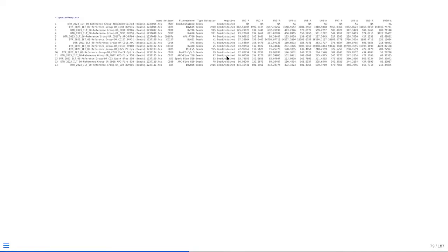But if we go back to what we had for that retrieved value, you can see it wasn't able to correctly retrieve the actual signature from the bead unstained just because no detector value was provided, so we had a little breakdown in terms of the code. So basically what we need is, we have the signature values for our bead unstained. We need to substitute them in for this particular NA that's all across this individual row. So we basically need to cut and paste it, in terms of R.